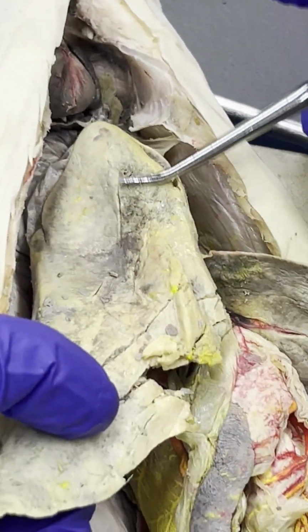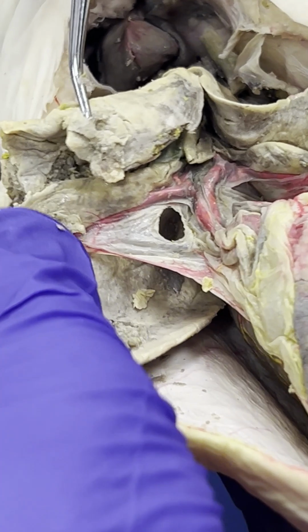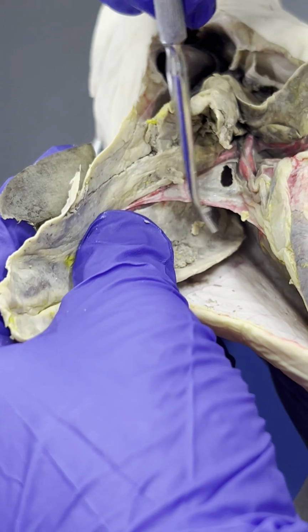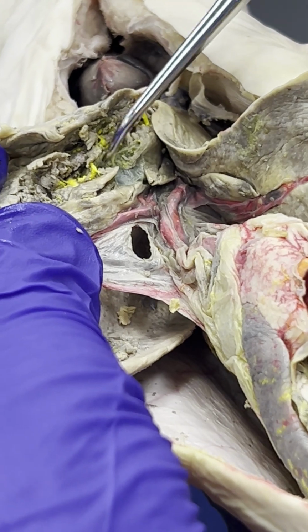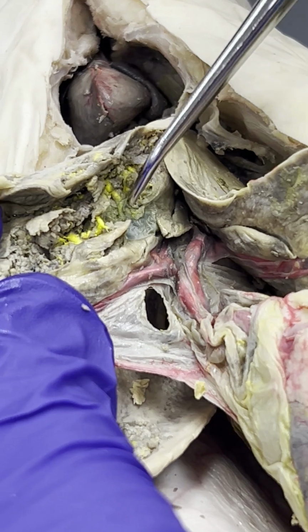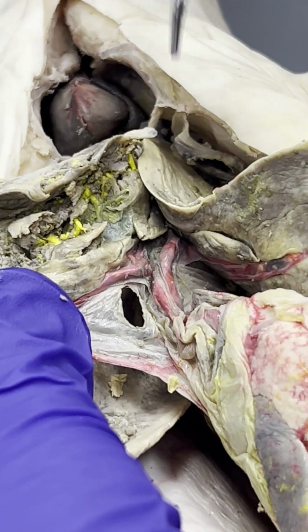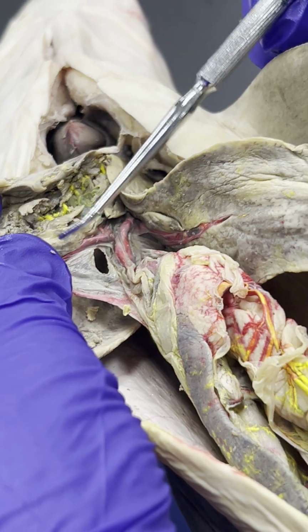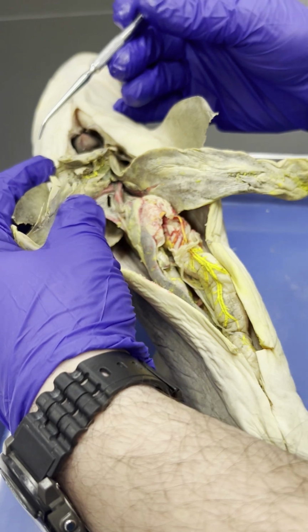So here is one look at it right here. And then also, if we get under it, we could actually see here's the median lobe of the liver, again, attached to the right lobe of the liver. Since we're here, let's take a look at this dark green structure. Hopefully Dr. Mick, who's behind the camera right now, could get that in focus. But this, you guys should be aware of as well, is your gallbladder. Not your gallbladder, this thing's gallbladder. So it should be relatively easy to find because of the color, but also it is attached to the median lobe of the liver.